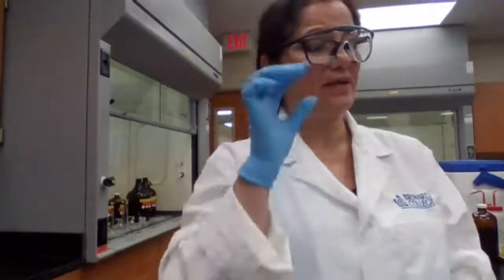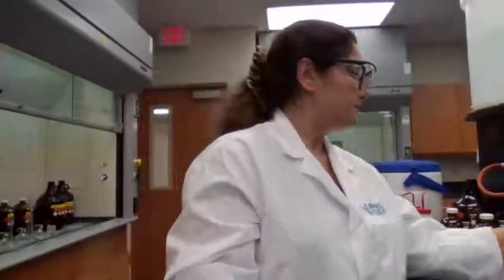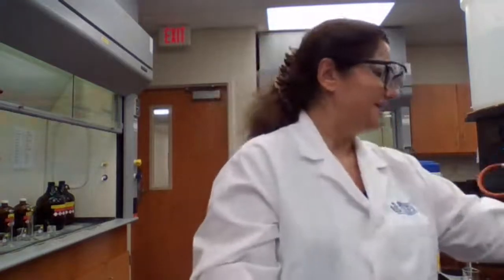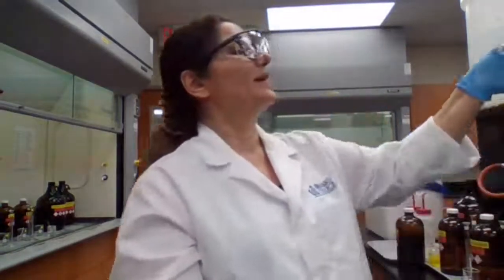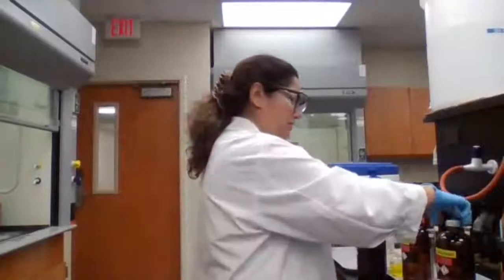We're done with part B. We are moving to part C of the experiment. That is for ammonium chloride. Going to find a clean test tube. There are plenty of test tubes, but you need to find a clean test tube. Okay, that's the challenge, huh? Find a clean test tube, add 1 milliliter of saturated ammonium chloride.